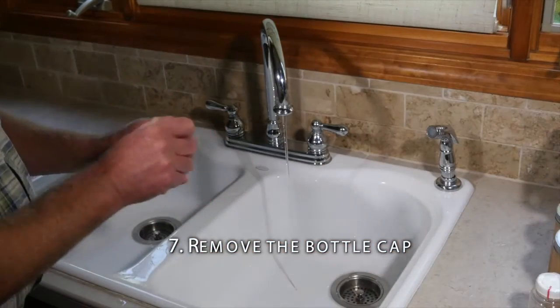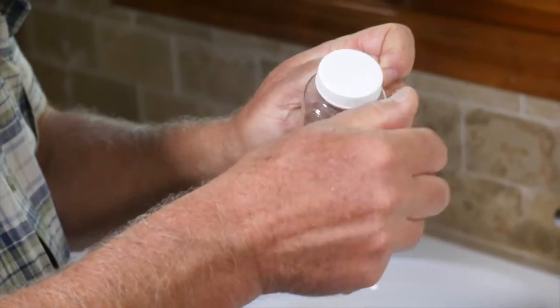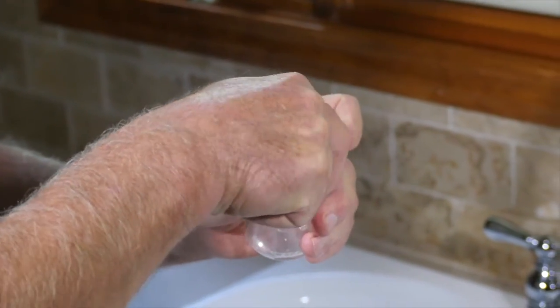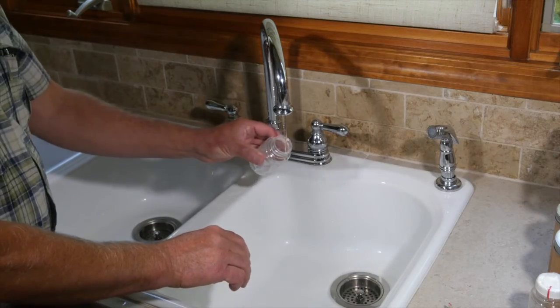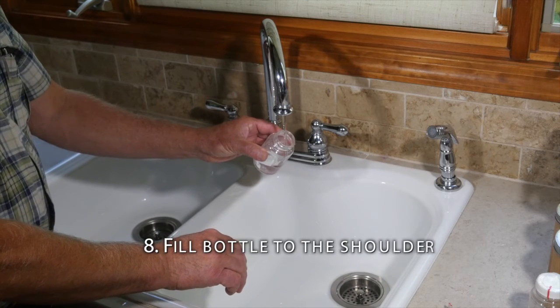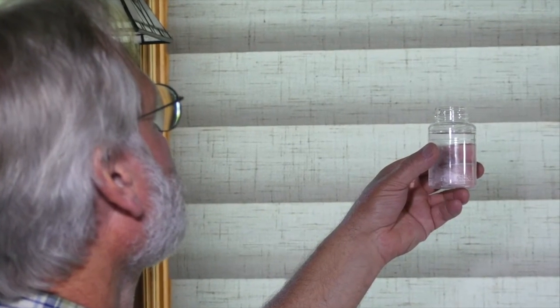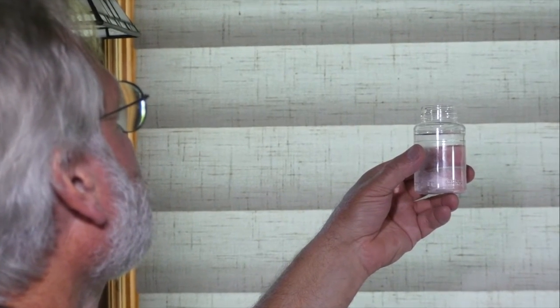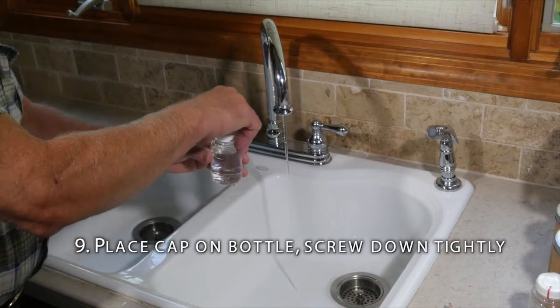Remove the bottle cap. Be careful not to touch the inside of the bottle or the bottle cap. Do not lay the cap down or put it in your pocket. The only thing that should go into the sample bottle is the water sample from the main. Fill the sample bottle to the shoulder, approximately one quarter inch from the top. Some bottles have a line at the proper level. Do not rinse the bottle. Place the cap on the bottle and screw it down tightly.